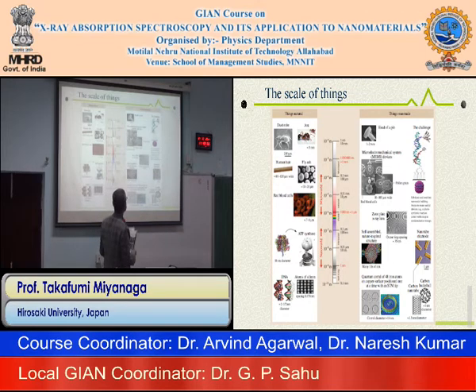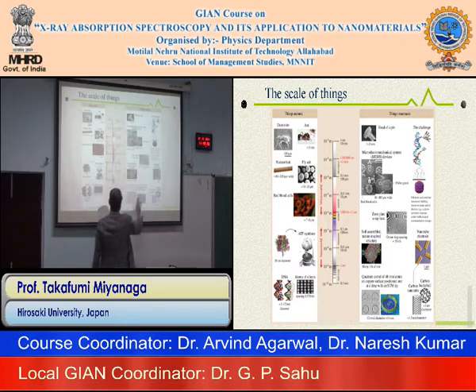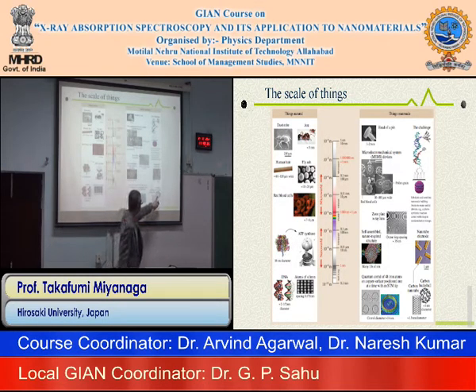science and technologies. We can find the zone plate X-ray lens, the artificial system focusing the X-rays. X-ray has a similar Ångström wavelength, so the nanometer artificial technique should be used for the several treatments of the X-ray region. And then there is the carbon nanotube or fullerene.